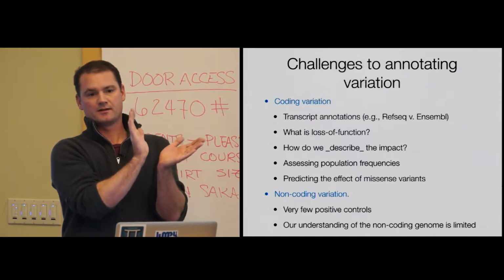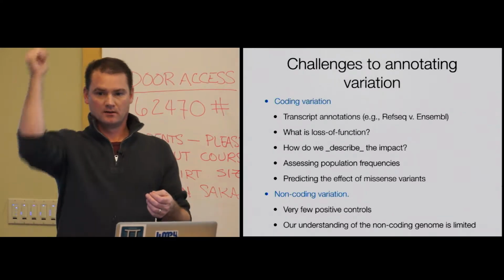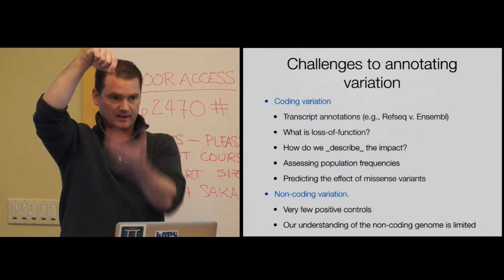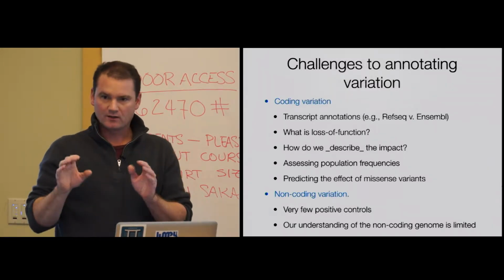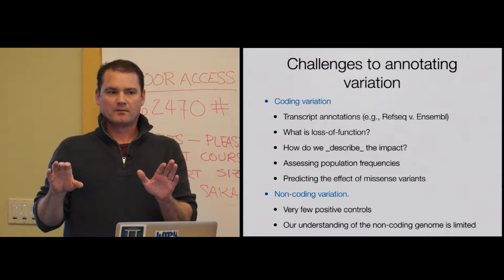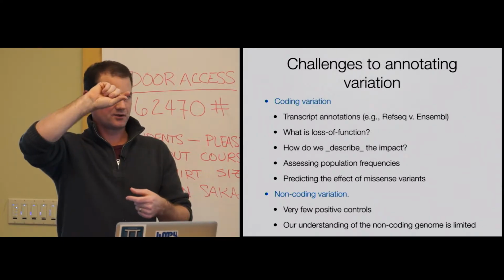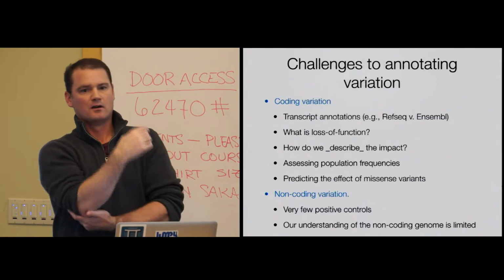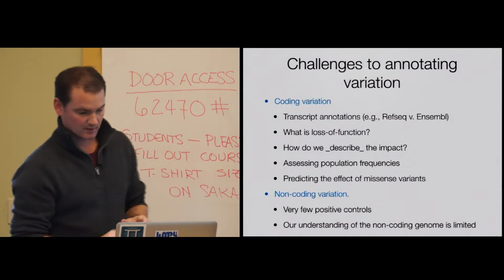The other dimension is that we depend upon software tools to look at the position in the genome, the set of transcripts they're using, and make a prediction as to what the change is. By and large, it's straightforward. You're effectively looking up the codon table to figure out what amino acid change would be predicted. But there are corner cases, and we'll talk about that.